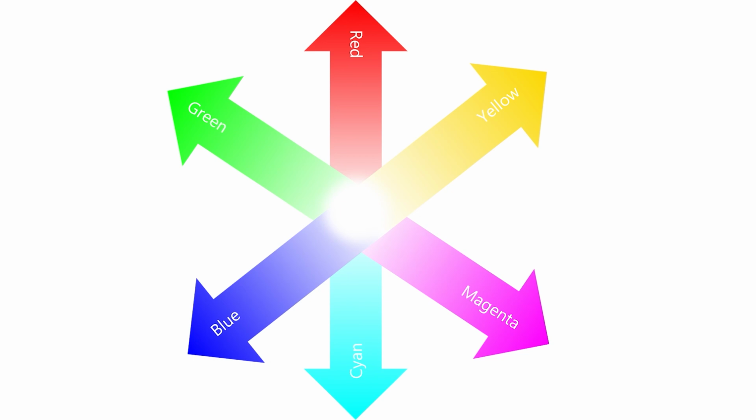So to put things in the simplest terms possible, similar colours will lighten itself, and an opposite colour will darken the opposite colour. So if we were to think about the most simple example being ninhydrin on something like a dollar bill, so a green background, if we were to use green light on that surface, that green background will reflect all of that light and it will seem to lighten as we perceive it.